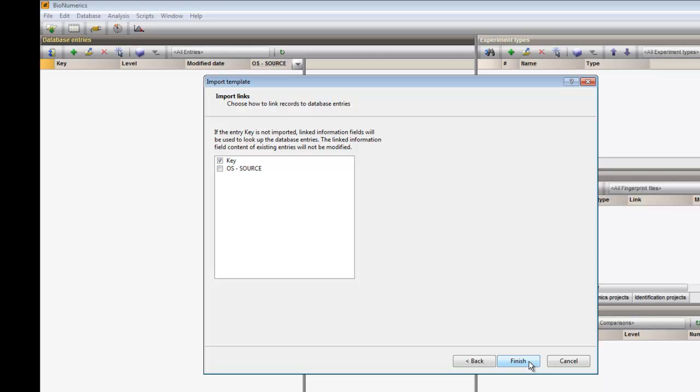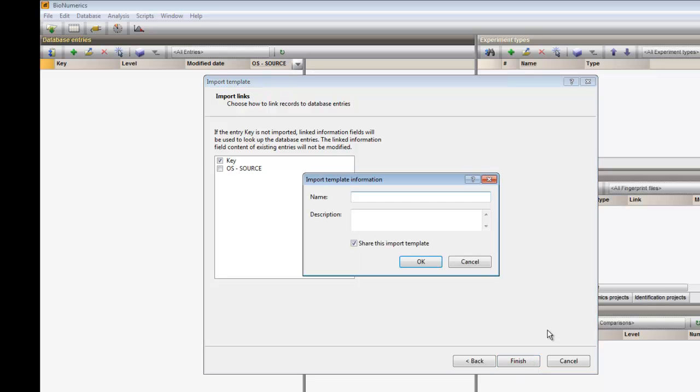As an entry link field, I use the key, as this is a unique identifier for my entries. I click Finish and I am prompted to give a name to the new import template.